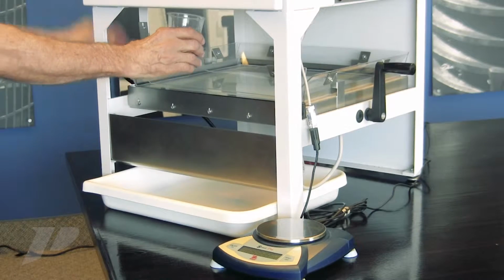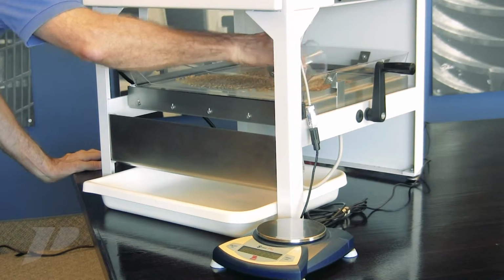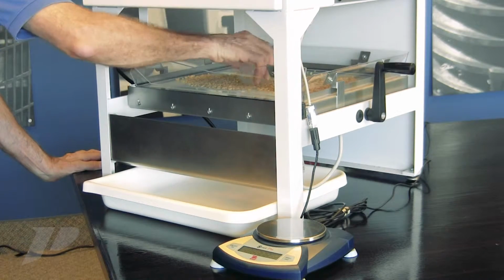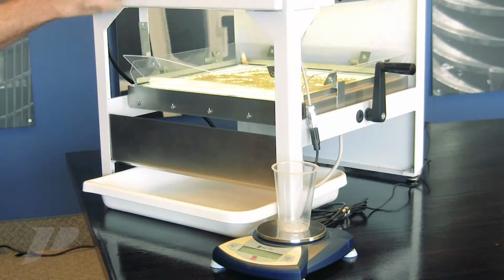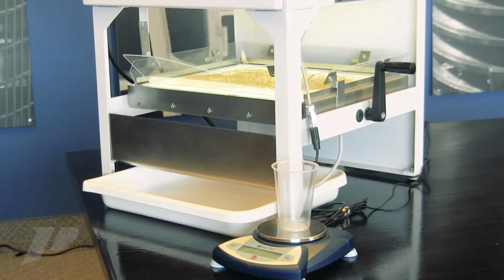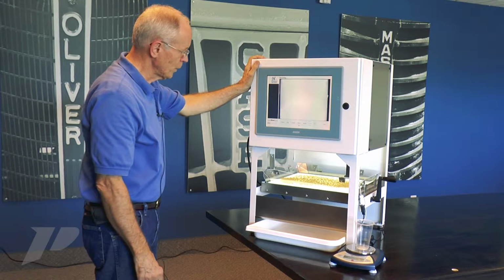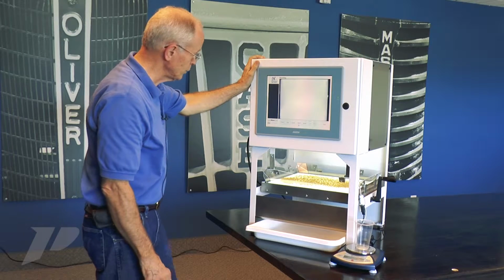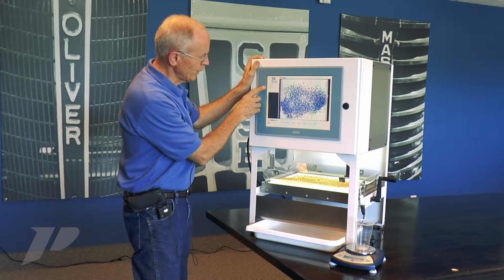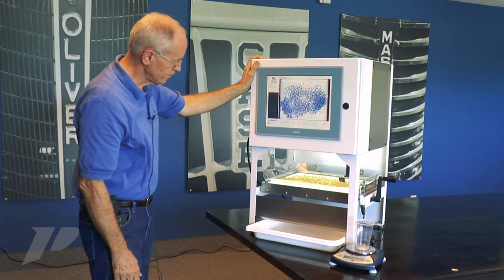Pour the sample on the stage and spread it out a little bit. When we click Next, the stage will vibrate to monolayer the product and spread it out. And we'll take an image and process that image. We're going to count the kernels on the stage. We'll show you the count that we had, and we'll vibrate and count again.